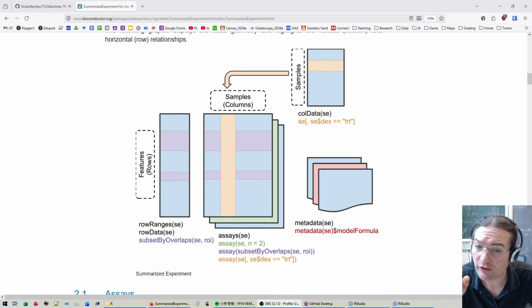If you want to subset rows, you would use it in the row section, although they also have some other tools they don't demonstrate here. My diagram, I think, is a little bit better, and it reminds you that if you wanted to subset the rows, you would just put logic to the left of the comma, because it's organized based on this central area.